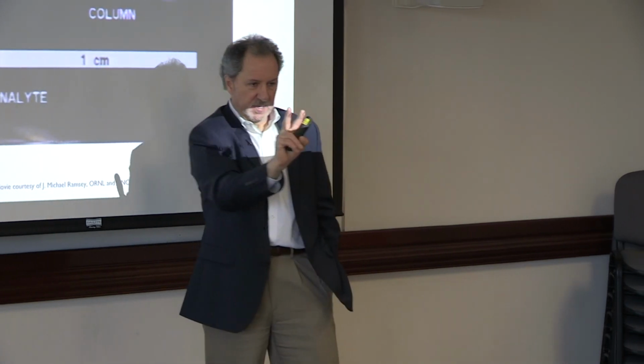So watch after the injection. How long does it take before you see 2 entities separated? So Deborah, I want you to count. Ready? Go. 1. So in a second, you've already resolved 2 chemicals that are distinct based on their charge.